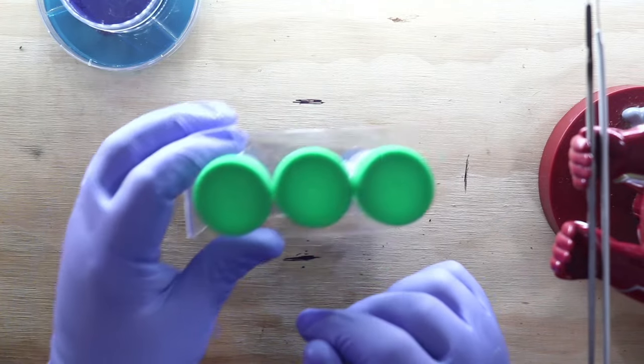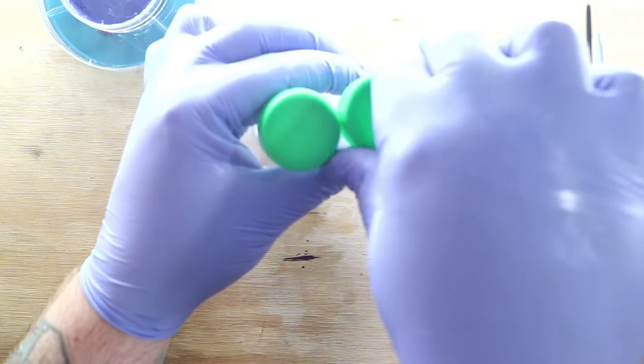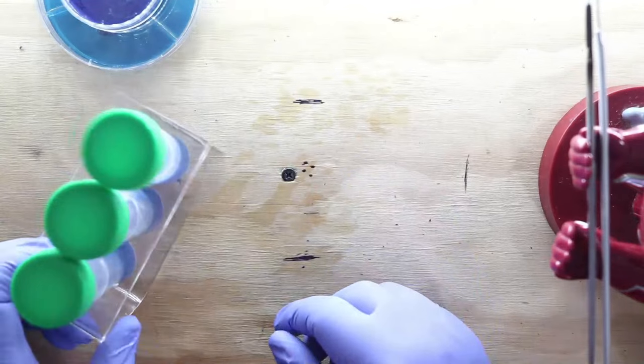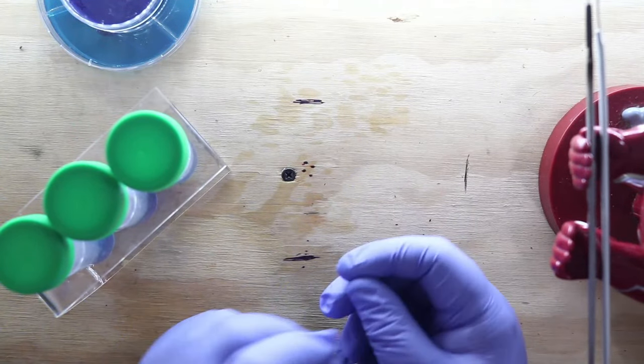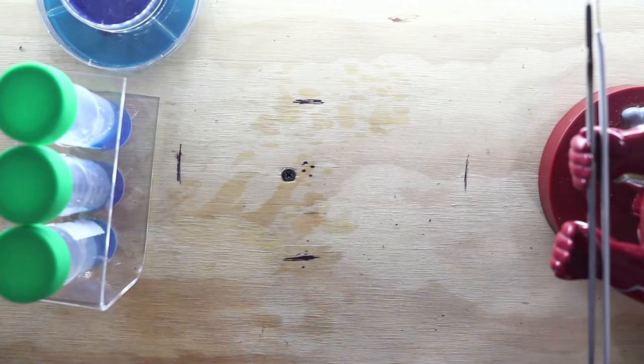Okay, we'll take these. I'm going to pre-loosen them. Those are a little higher, Andrew. They're not quite as in focus. I'm not really that worried about it, because I'll pull them out. They're not going to be the center of the show at the moment. Okay. Maybe next time we can get something like an Icarus board or something that's backlit. That way, whenever you put the plate on it, everybody can see more clearly. Yeah, that's a good idea.